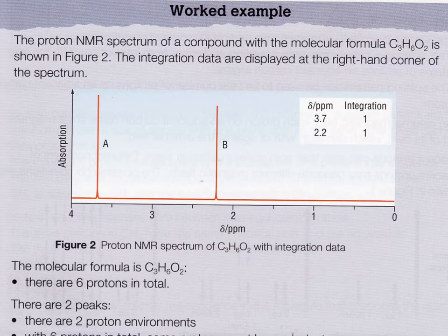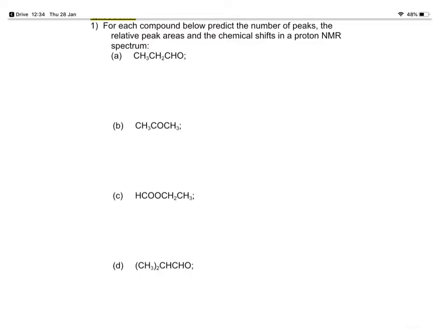Now it's a good idea on page 7 just to take yourself through the worked example, and it's summing up everything that we have talked about so far, but it's another chance just to get that cemented in your brain. Now if you read to page 8 then, we're going to look at each of these compounds in turn.